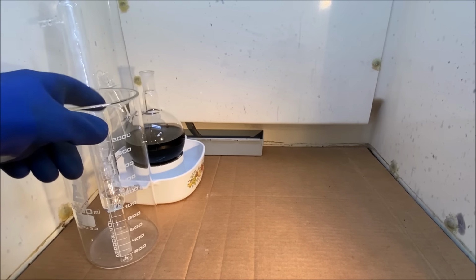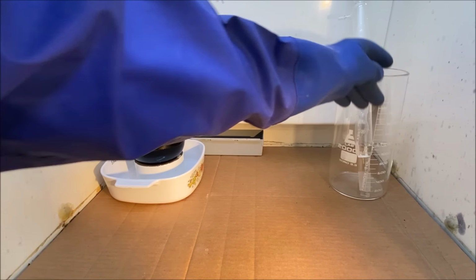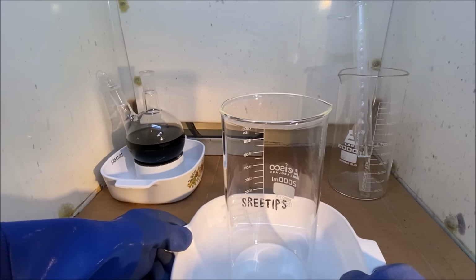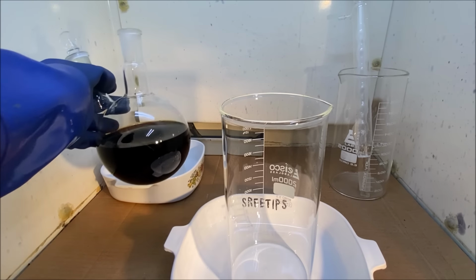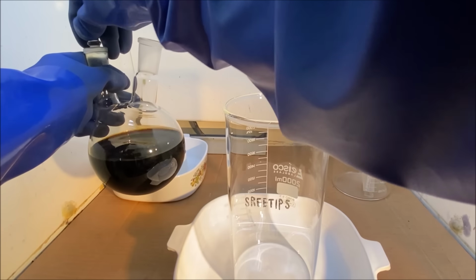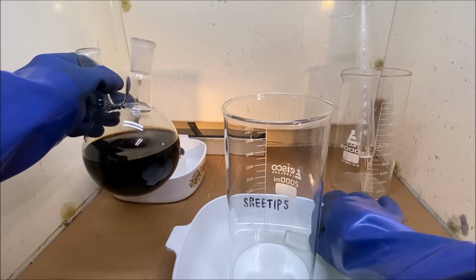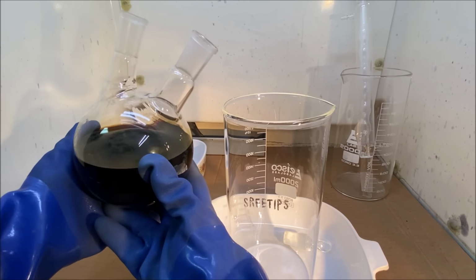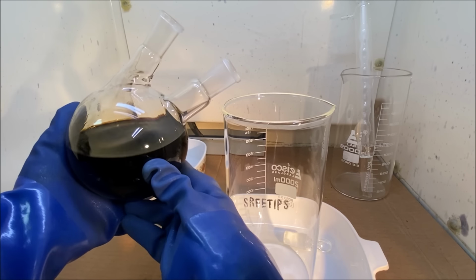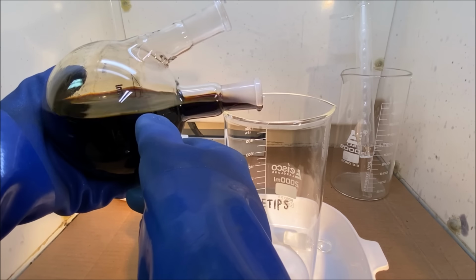What we'll do now is transfer our solution into this beaker. Still kind of warm. I'm anxious to see what kind of material is going to be left in here. How do we want to do this?